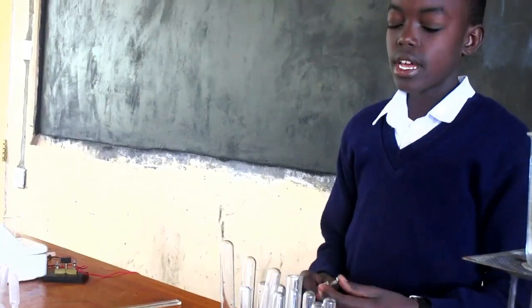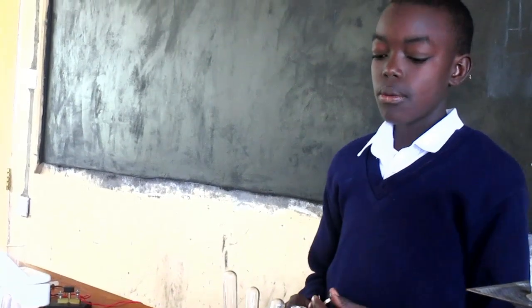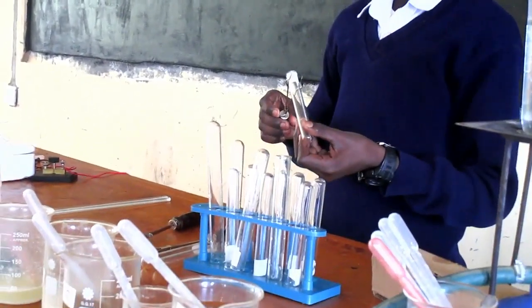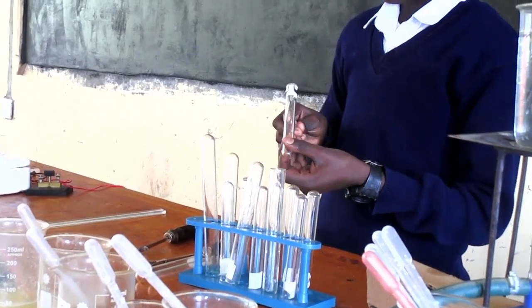My name is Ryan Vedasto, form 2 in Kissimilu Secondary School. In food tests, we are going to test if a food sample contains starch. First, we are going to take a test tube of sample B and put it in a test tube holder.